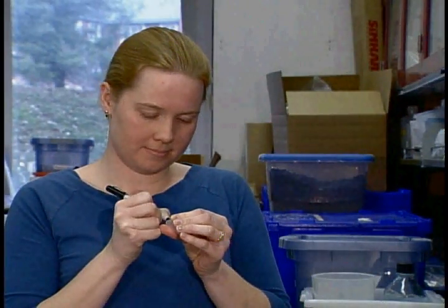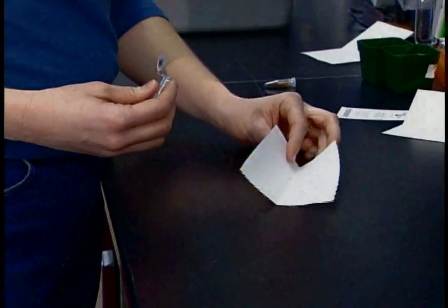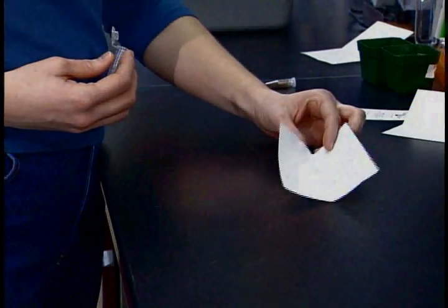Before measuring out your seeds, take a 1.5 milliliter tube and mark it with the date and the kind of seeds that you're using. Crease a piece of paper, then carefully measure out your seeds. After measuring, gently pour the seeds into the tube.